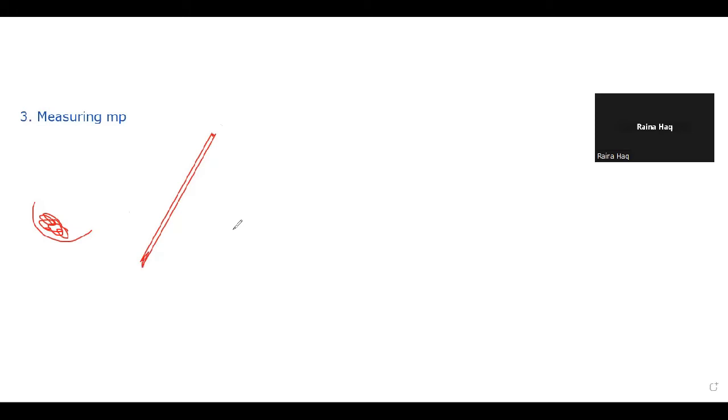ওকে, then you take some sample here, এই স্যাম্পলটা আবার উল্টা করে, ইনভার্স করে, এই টিউবটাকে এরকম করে হাত দিয়ে আস্তে আস্তে নিচের দিকে নিতে হয়। This is a challenging process.